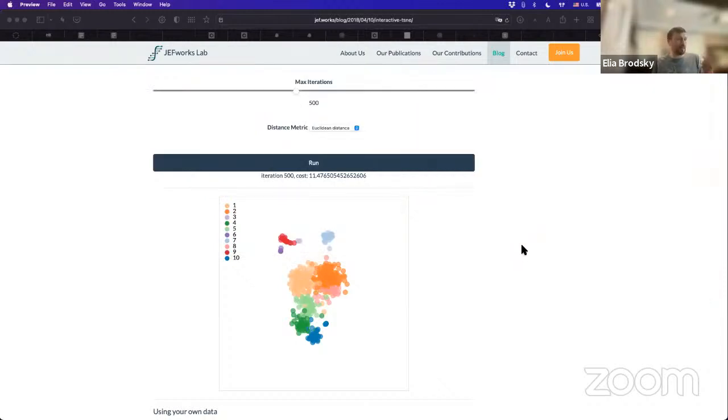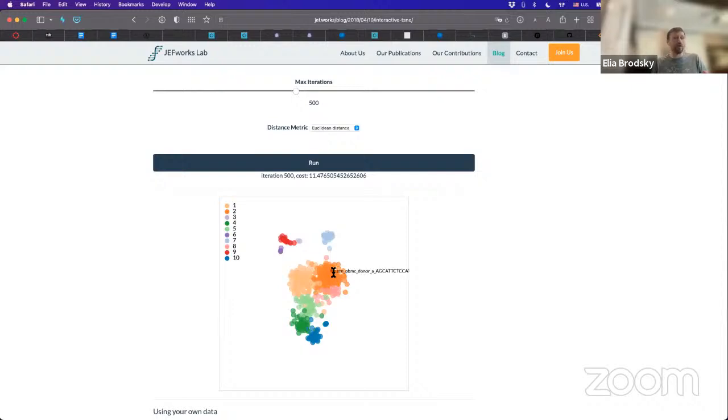You're correct, Nicholas. So it depends on what? It depends on what the data is. How do we work in biological experiments? The data always has controls. So the first thing I would like to know is whether my controls are grouped together. Now, in many clinical settings, I'm not going to have exact controls, but I'm going to have an idea of these controls. And so it's a lot more difficult than you would imagine. You look at these publications and they all have these nice t-SNE pictures, and they see, this is a cluster here, and this is a cluster here. Everything seems so easy and perfect. In reality, it is not.